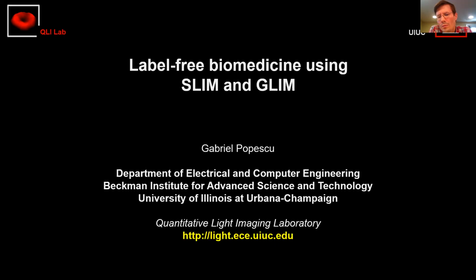So from the fluctuations, with a physical model, we were able to get out the shear modulus and bending modulus of the membranes. And then we showed that as the malaria infects the red blood cells, these moduli are completely different. So the cell becomes really, really stiff, and it basically loses elasticity, and that's how the cell breaks and the parasites multiply. It's all this mechanically triggered process that is incredible. So anyway, I can talk for many more hours about this, but I think you hit on a great application for this method. We did some work.